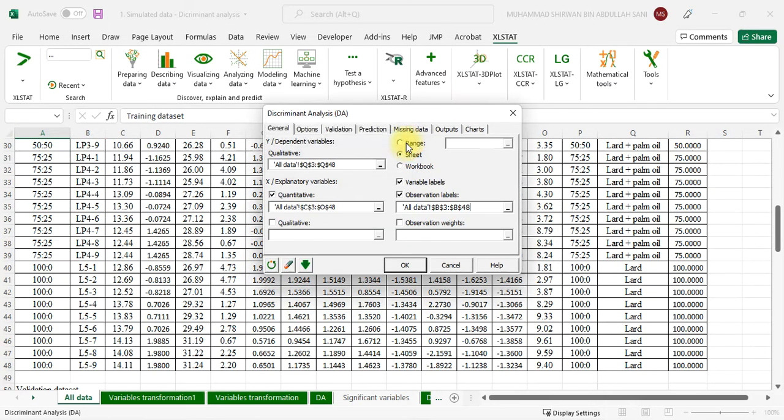Okay? Done? Okay. So we have training, we have validation, we have testing data set. So the one that we are filling in now is using the training data set that will become the database. Need to repeat this many times, memorize it. Tomorrow you will be on my team as a trainer for this stat.